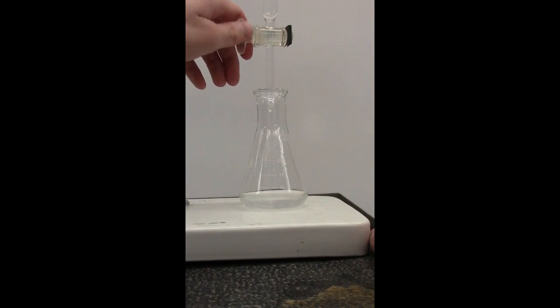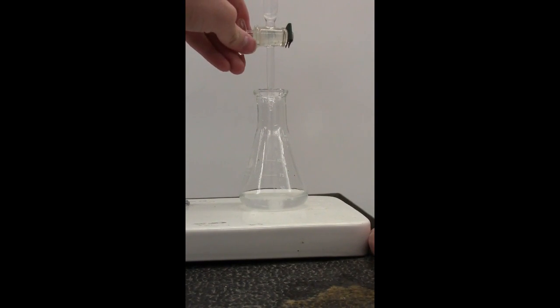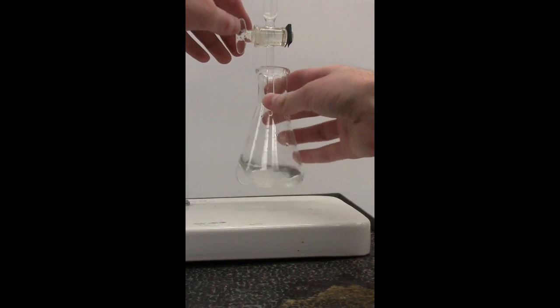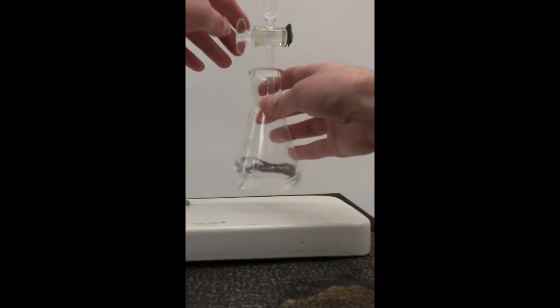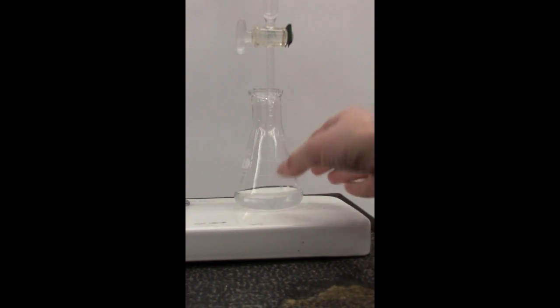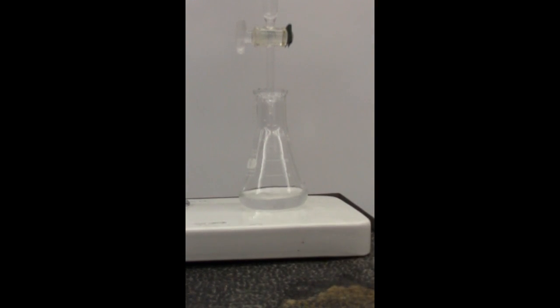So as you can see, we can do it quickly. We can dispense it slowly, as in dropwise, and all the while we'll be stirring it as the titration occurs. Once you get close to the end point of the titration, you want to go dropwise, such as it's going now. Now we want to finish.